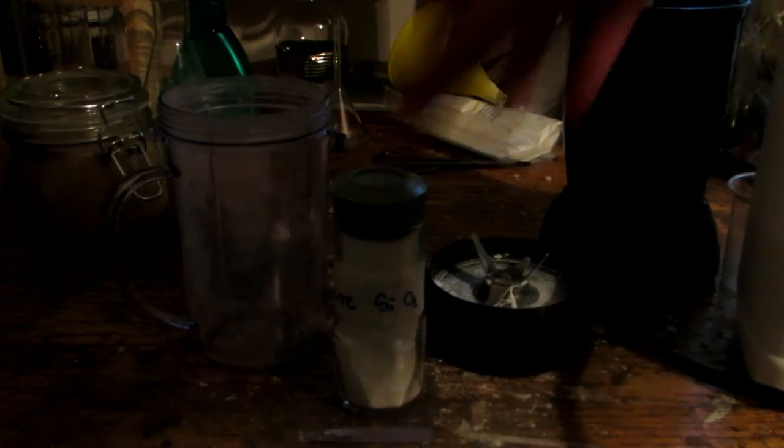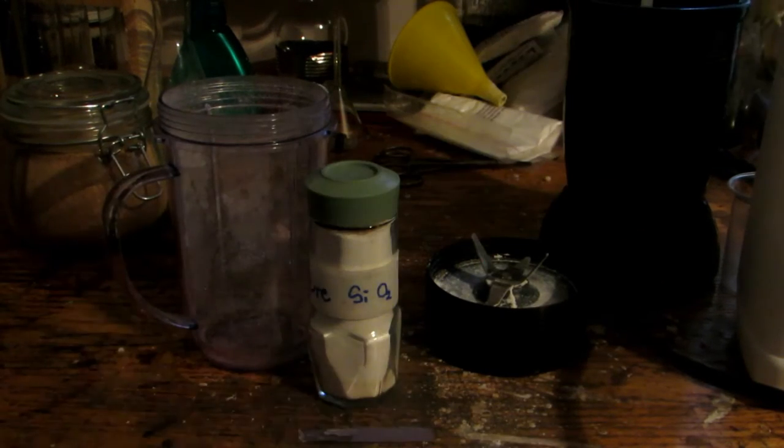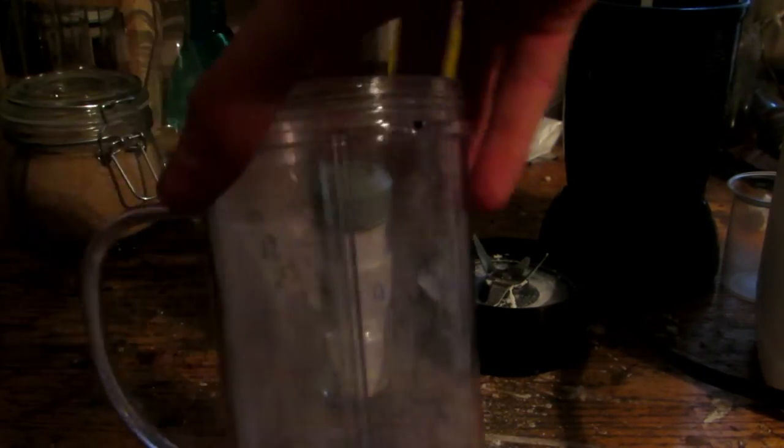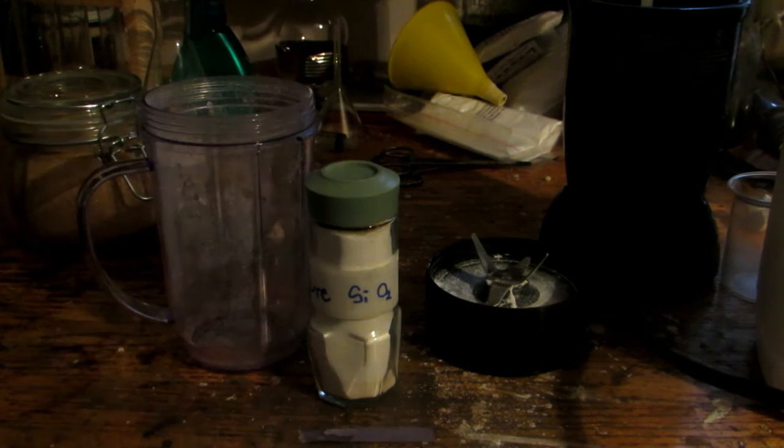We'll probably use 20 grams of it, then multiply 20 by 1.33, and add that many grams of sodium hydroxide. We will then be grinding it up in a blender, which is strictly for chemistry. This will get the powders very finely mixed together, so we get a much more complete reaction when we heat these up.